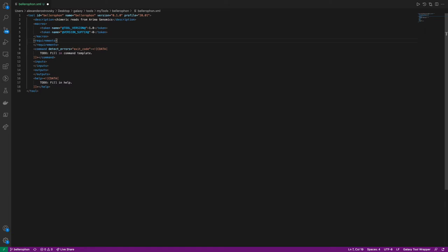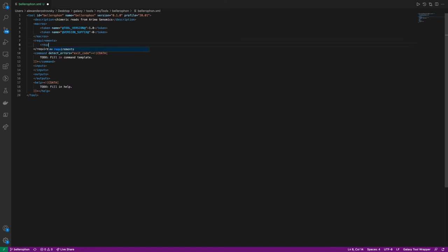The requirements section, in this case, is used to list all of the BioConda and CondaForge packages, as well as their versions, that will be used in this tool. Here, we will be using two different packages. First is, of course, Bellerophon.